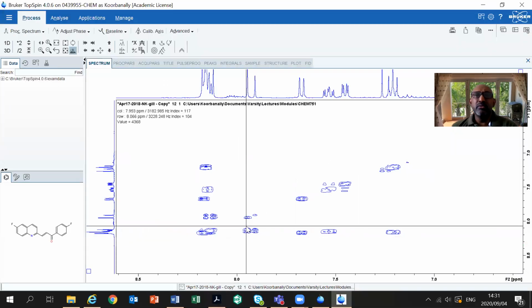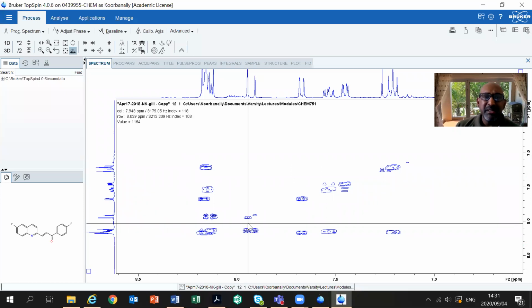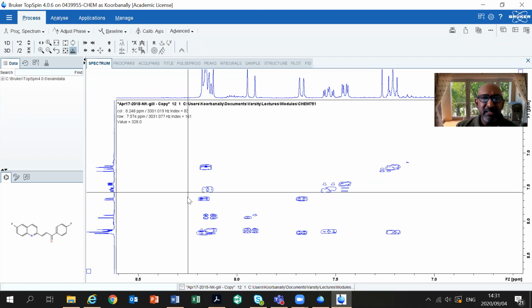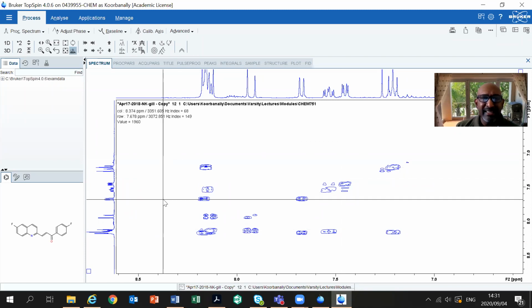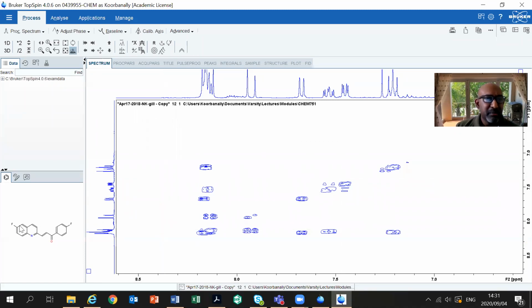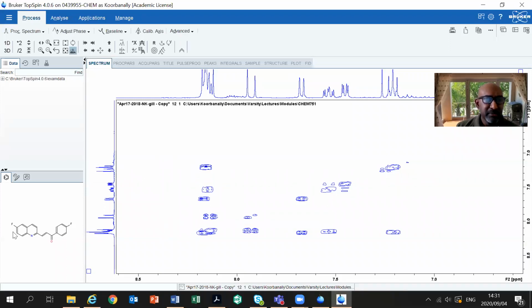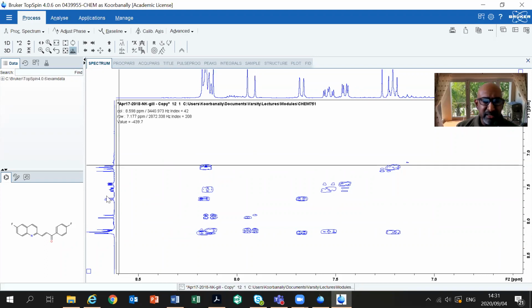All right, why I told you all of those things is because we're coming back now and looking at this particular spectrum, and we're going to see what evidence we can actually get from it. But before we get to a spectrum, we need to look at a particular structure. I'm going to look at the structure here because I have proton resonance. So each of these are proton resonances.